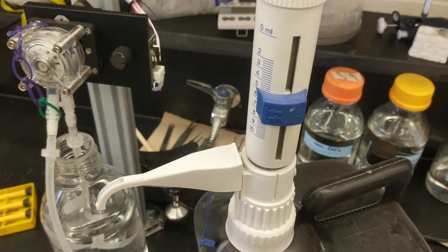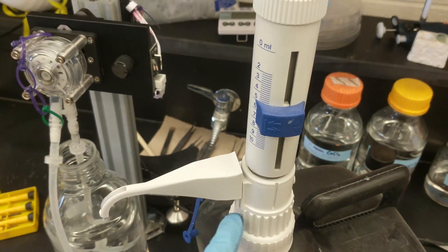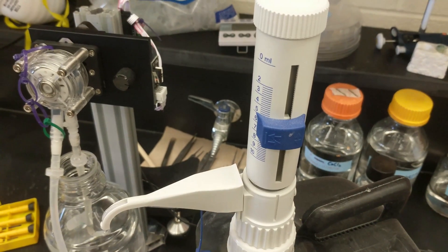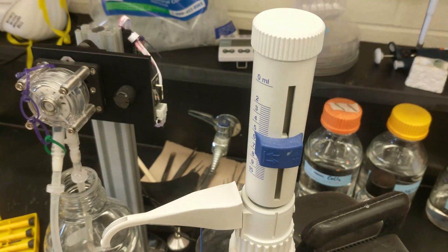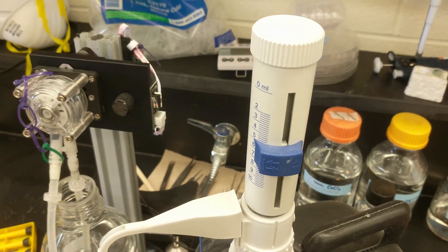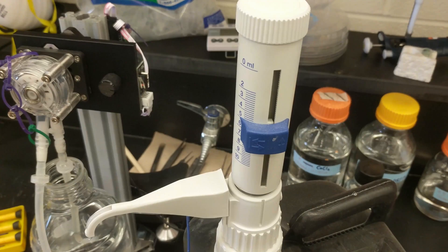So if you want one of these for every bottle of buffer, then unless your lab and your PI is particularly spendy, I wouldn't bet on it.